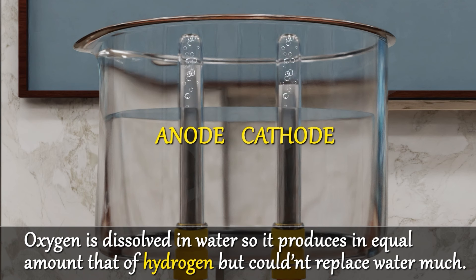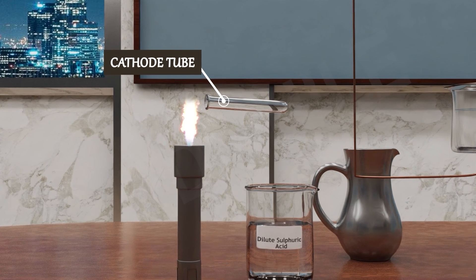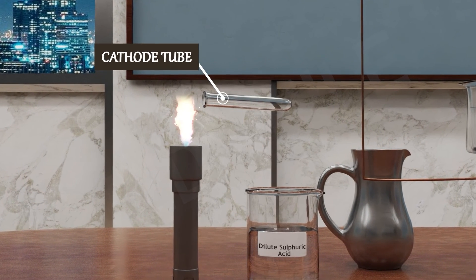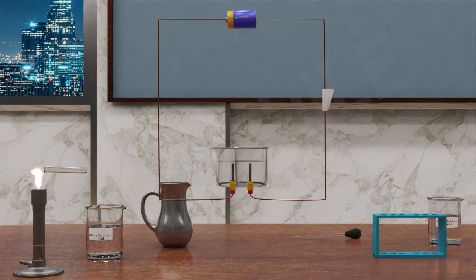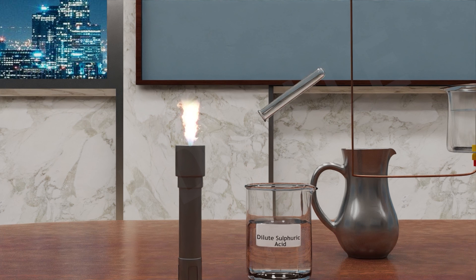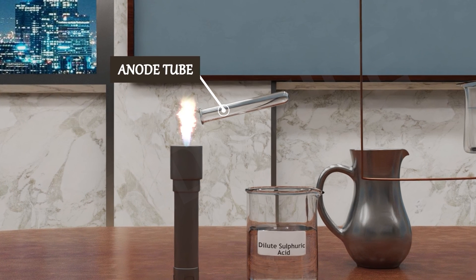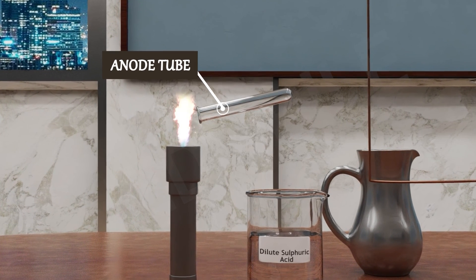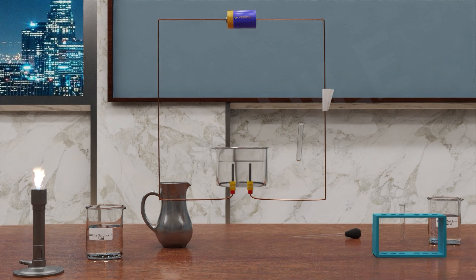But how do we detect the presence of hydrogen and oxygen? If we bring the cathode tube close to a burning candle, it will produce a pop sound — that means hydrogen is present. Now if we bring the anode tube close to the burning candle, it will burn very strongly and very fast — that means oxygen is also present.